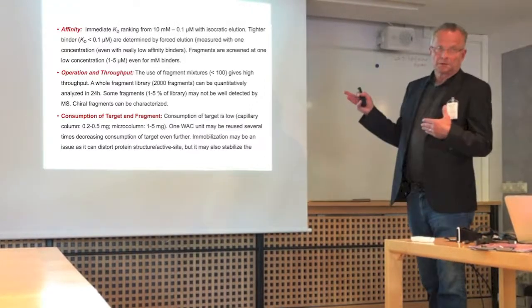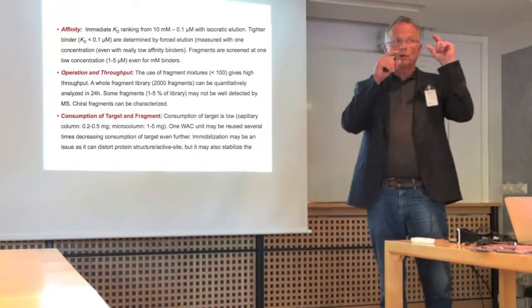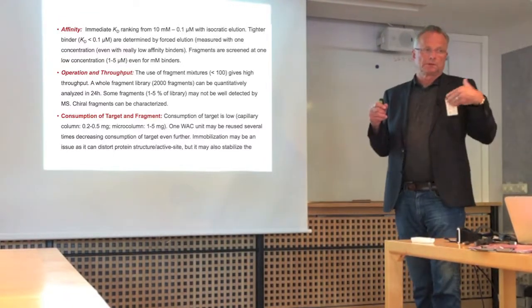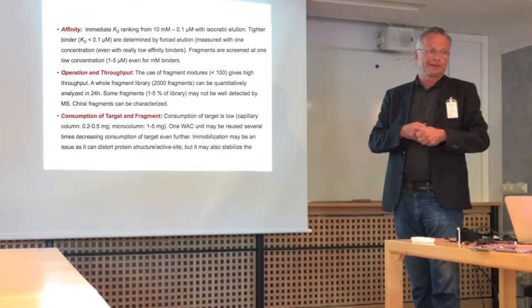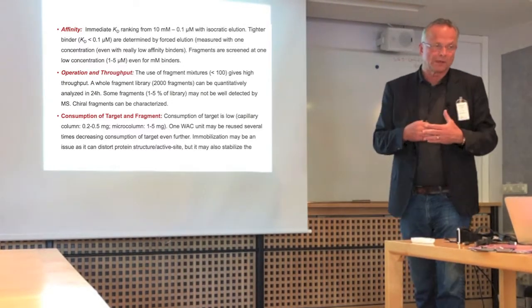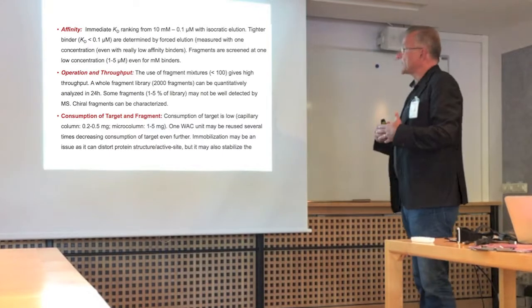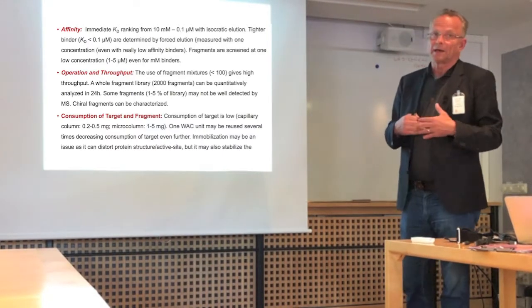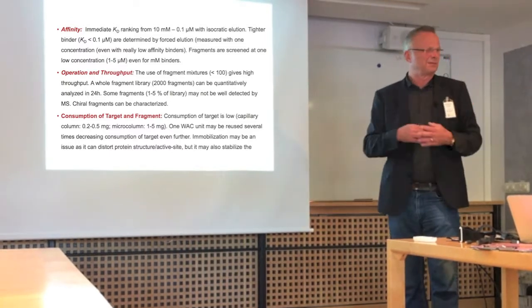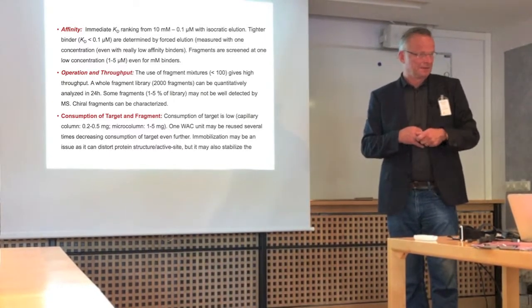Consumption, with the small capillary columns, we are now down to around 0.1, 0.2 milligrams consumption. And if we immobilize them well, they can last a long time. Now, one of the criticisms, of course, to WAC and SPR is immobilization, now you have a problem.